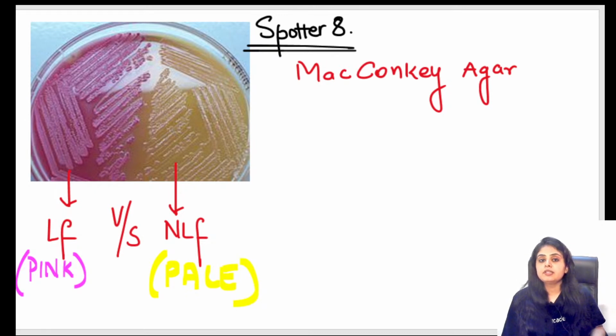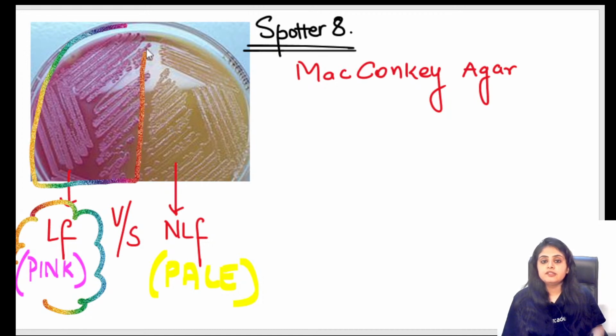So just remember that lactose fermentation is going to give us a pinkish color. That is the utility of MacConkey agar. So whatever was grown in this area is a lactose fermenter. What is the composition? This is another question.